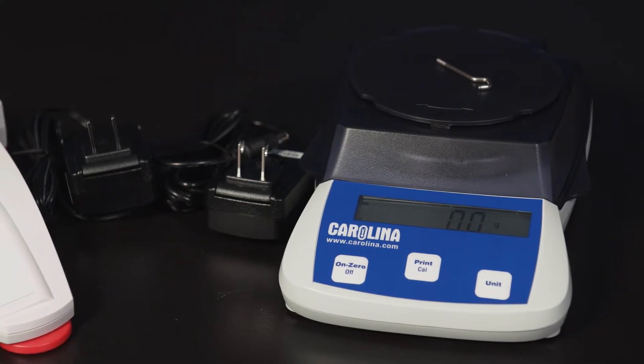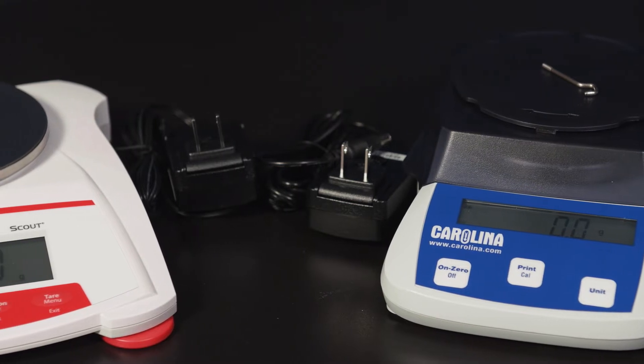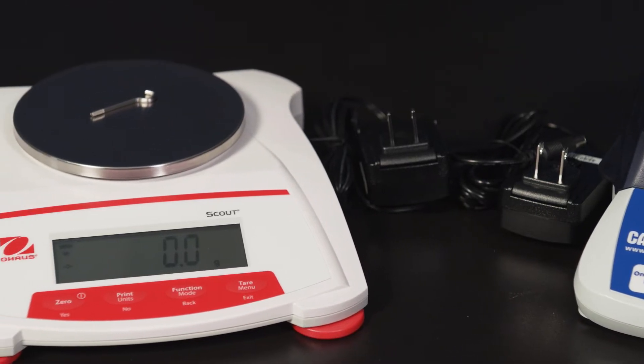At Carolina, we strive to meet your needs and budget with excellent quality. This video will compare the Carolina Electronic Balance to the Ohaus Scout Balance to help you choose which model fits your needs.